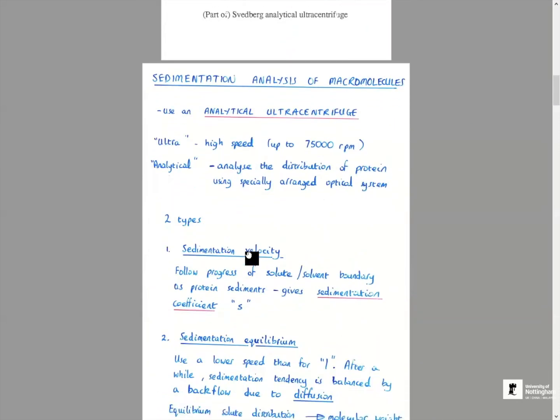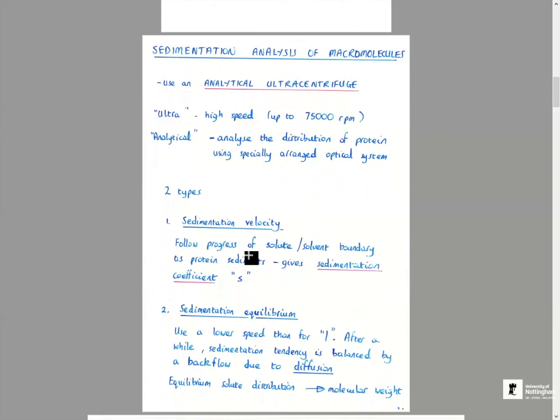Right, so that's the old centrifuge, which is a room full of components, optical components, refrigeration, vacuum, this sort of stuff. Why do we need a vacuum, by the way? Why is the experiment run in a vacuum? Yeah, the air heats up. So what would happen at these speeds? Get very hot. That's right. So you put your sample in for analysis and you have no sample left.